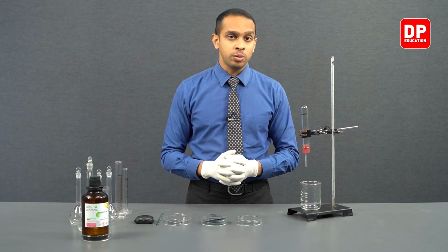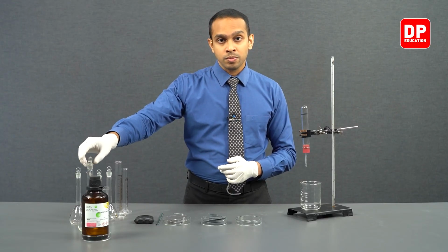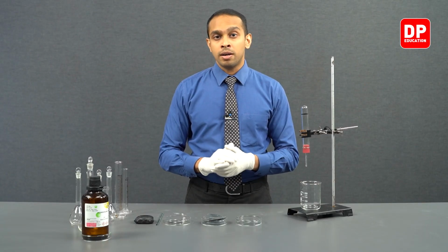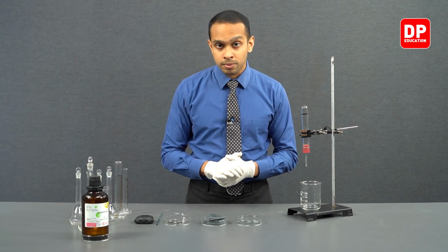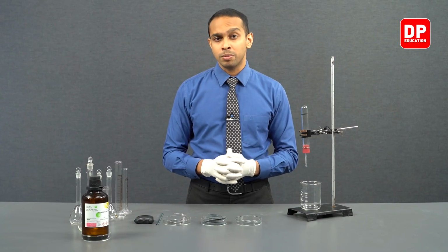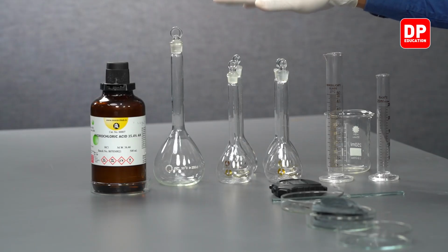And when we are trying to produce HCl solutions with different concentrations, we can use volumetric flasks. In this experiment, we need to produce a few solutions of HCl with different concentrations ranging from 1 mole per decimeter cube concentration all the way up to 0.2 moles per decimeter cube concentration. So we will be using these volumetric flasks to produce those solutions.